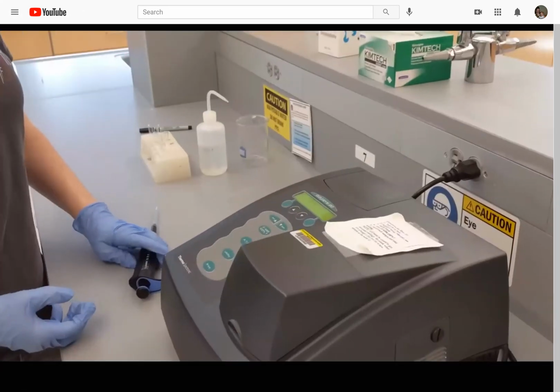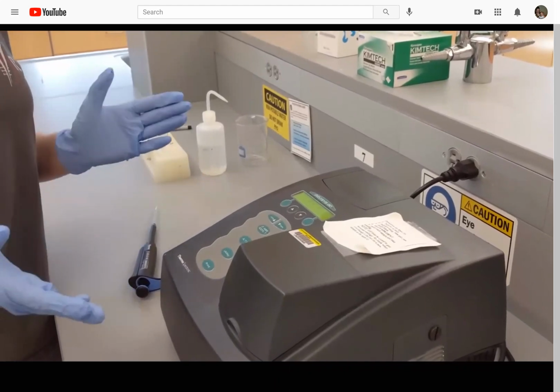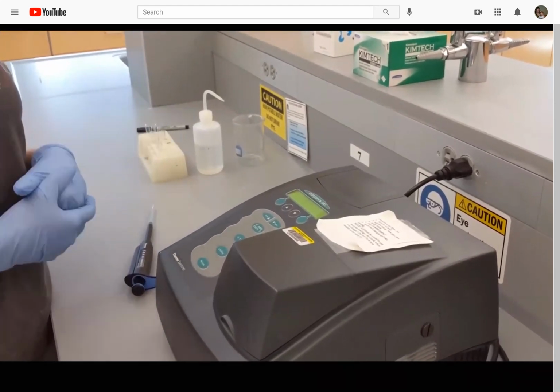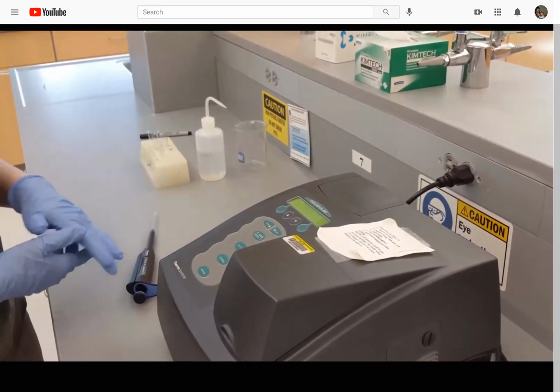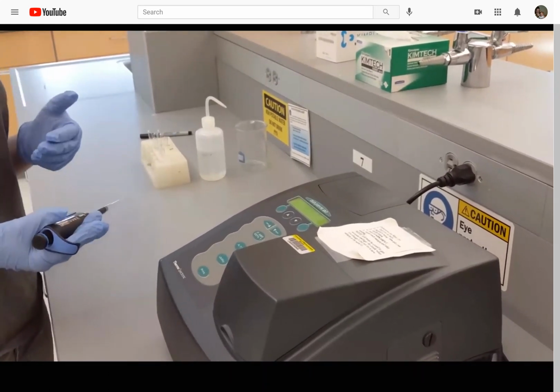All right, so the first thing I've done is I've turned on my spectrophotometer and set the wavelength to 520 nanometers, which is the wavelength we will be using to measure the absorbance today. So that's done. I had to let it warm up for a minute, so I went ahead and did this ahead of time.